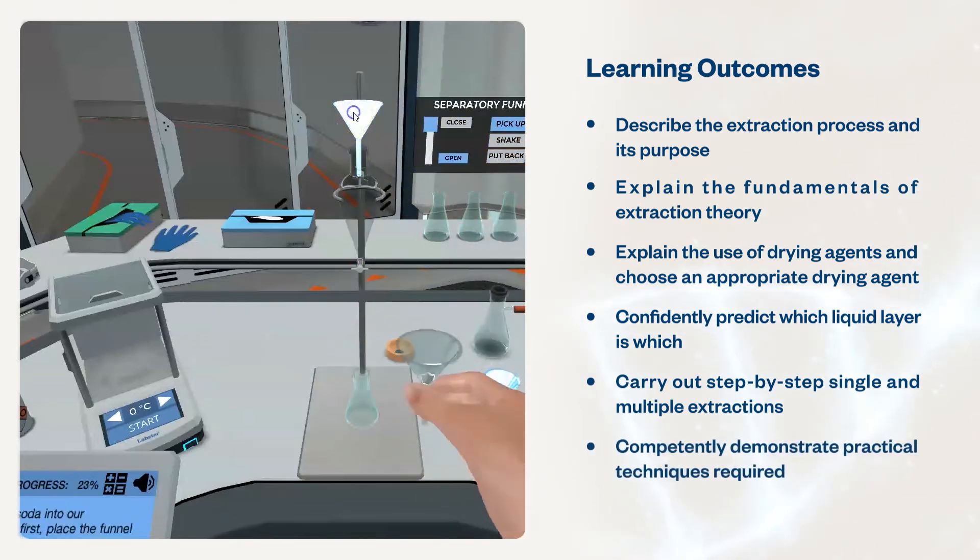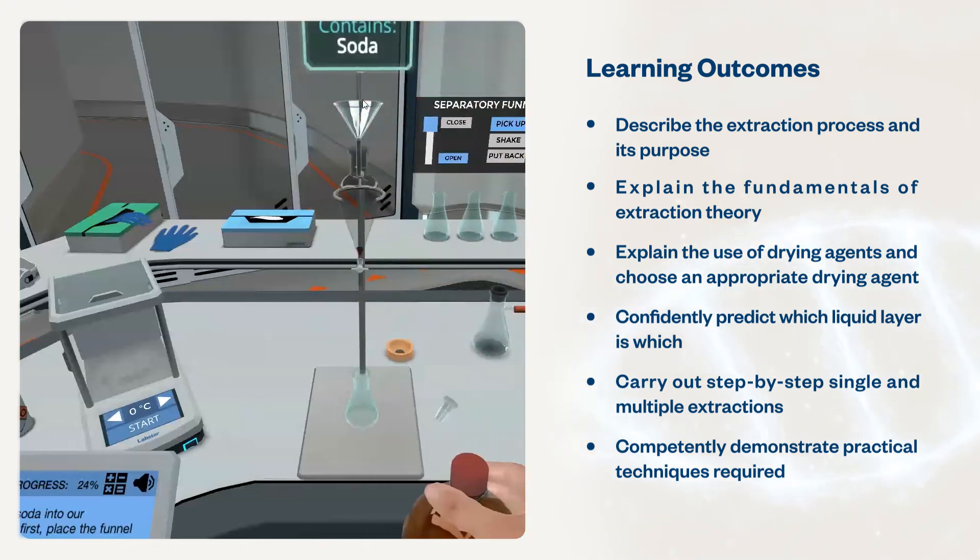Competently demonstrate practical techniques required specifically for solvent extraction by following best practice.